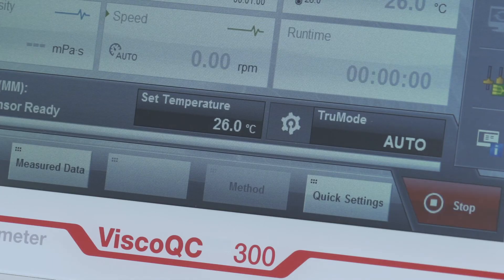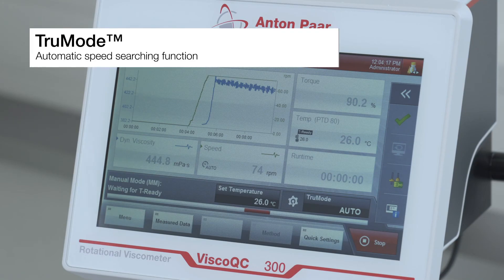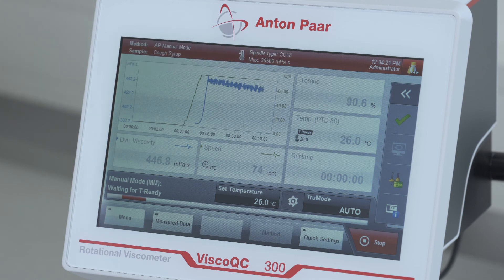If a speed-spindle combination to measure a new sample is unknown, the True Mode functionality automatically finds the best speed for you. All these features combined make Visco QC 300 the game changer in rotational viscometry.